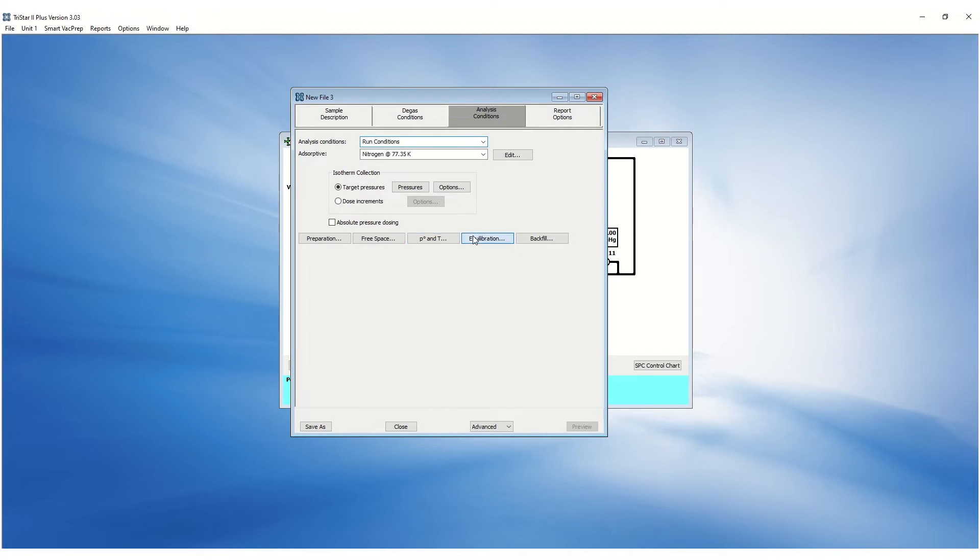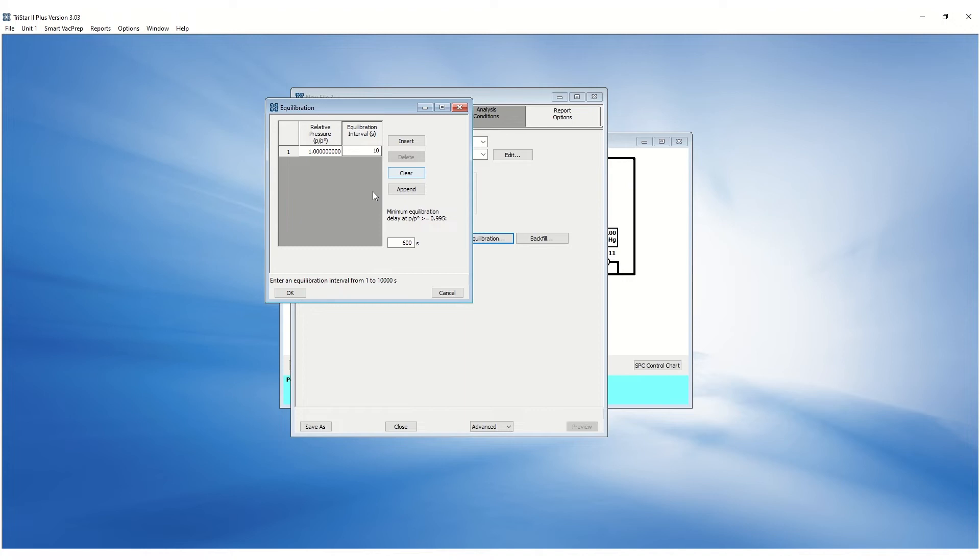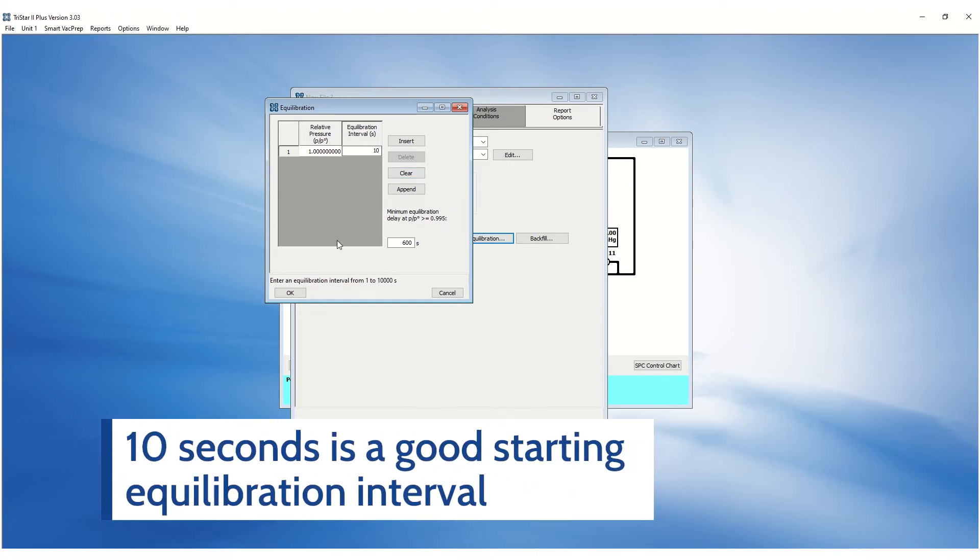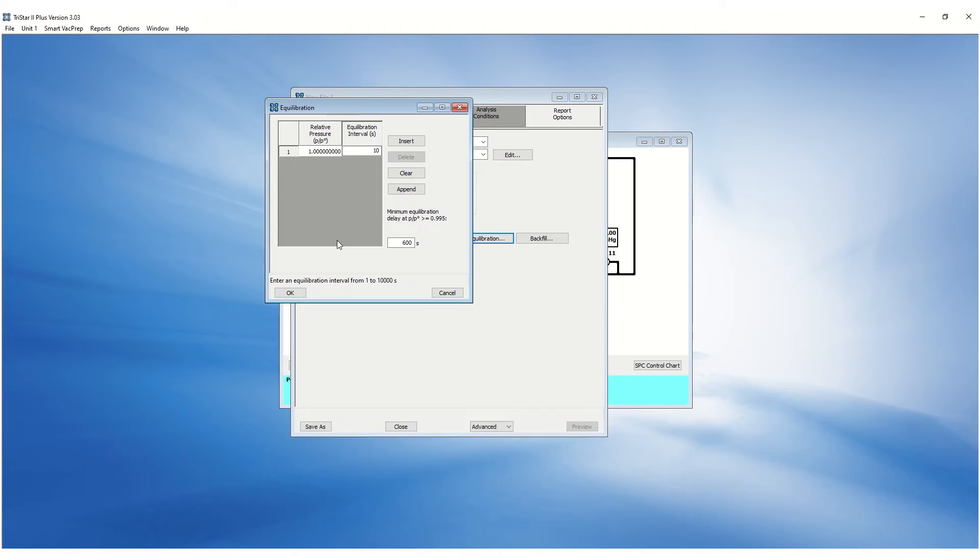Equilibration options allow the operator to customize the equilibration interval at different relative pressures. The equilibration interval is the time interval between successive pressure readings during equilibration. 10 seconds equilibration interval is a good starting point but is sample dependent. For example, if the sample takes a long time to equilibrate, the data will be prematurely collected before being fully equilibrated which will result in lower quantity adsorbed.